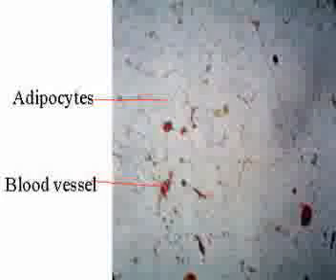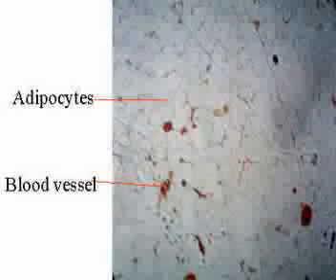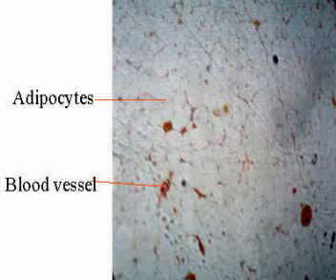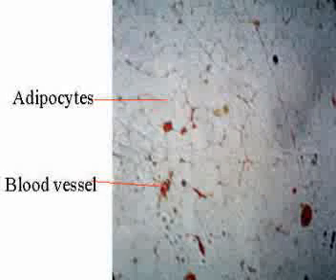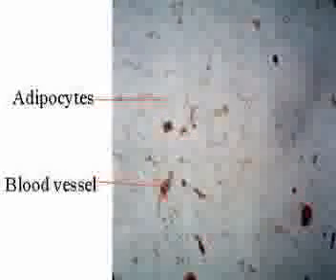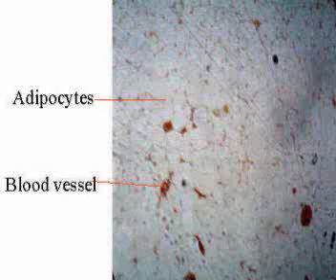Lungs have alveoli which look like holes. The difference is the septum between the alveoli in the lungs. What adipose tissues have are cell membranes and the remaining cytoplasm. But what surrounds the holes of the alveoli are alveolar epithelial cells. Other organs with multiple luminal structures, such as testes and kidney, have very thick interluminal walls.